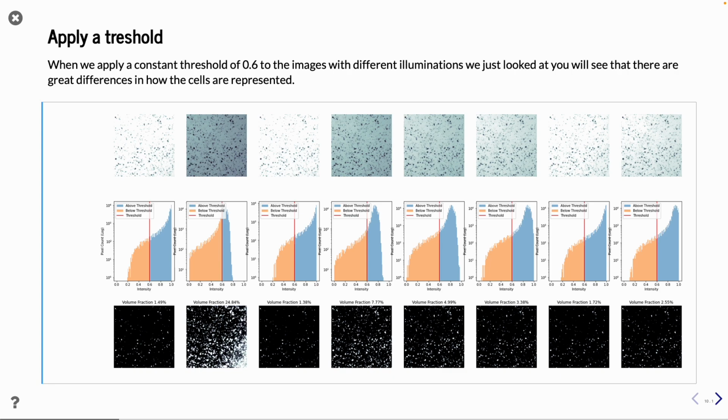One thing that I came across in the beginning when I started with tomography data was that someone had normalized all the gray levels in each slice of a tomography scan. So each slice had different threshold levels, and it was close to impossible to get a decent segmentation of that data. So be careful when you set the gray levels of slices in a tomography. Make sure that everybody has the same interval.